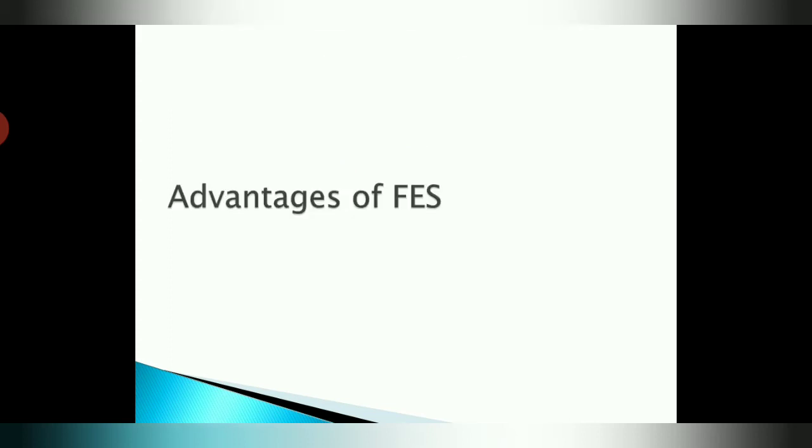So let us begin with the advantages of FES. It is generally more accurate, since the atomization into the flame is a more reproducible method of introducing the sample into the excitation source, which means this technique is very accurate. Second, it is a very fast technique. Third, it has much more sensitivity towards the detection of alkali metals and alkaline earth metals.